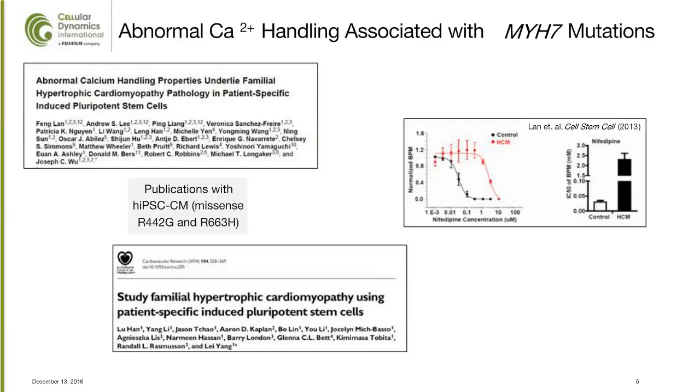We looked at this with the R403Q cells, and we saw the same response. We wanted to look a little more closely at the effect of calcium channel block on irregular beating as well as the effects of mechanical overload.